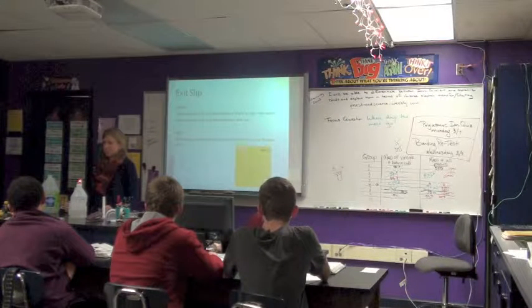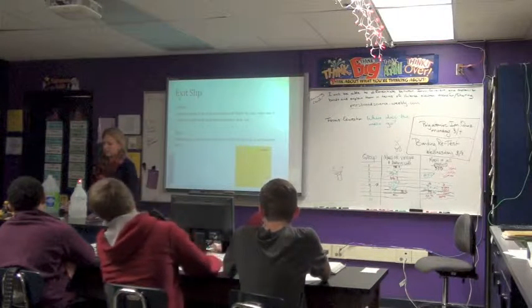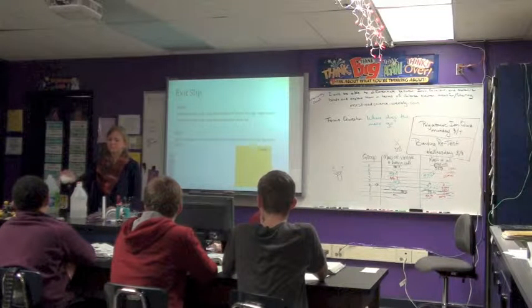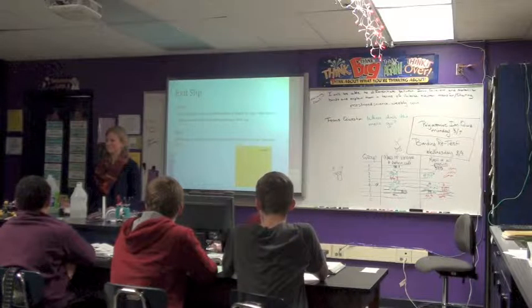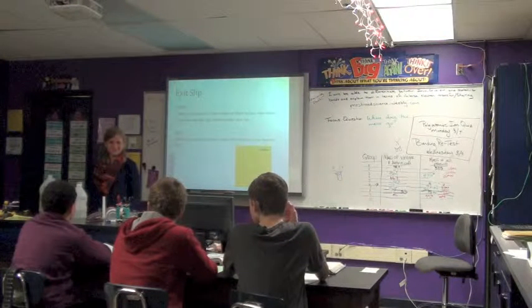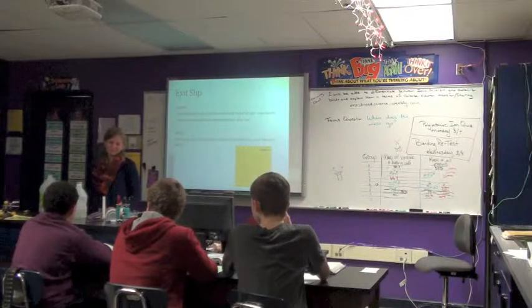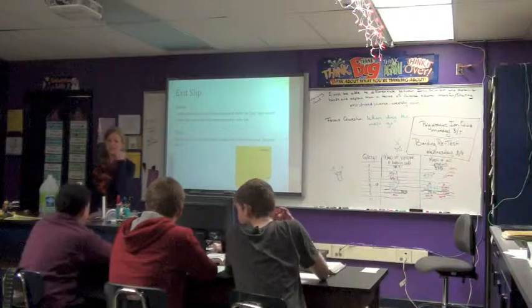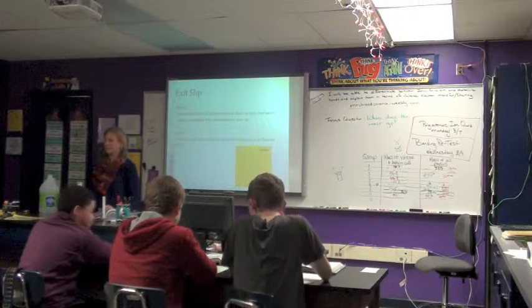Okay, so it's the same thing that you guys just did. I'm going to let it react a few seconds. Can everybody see the flame? Yes. So cool. There's carbon dioxide in the air too.